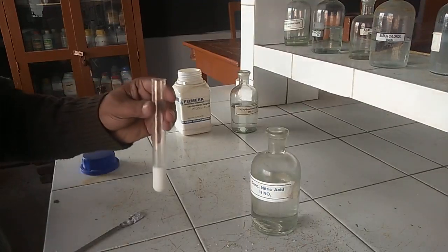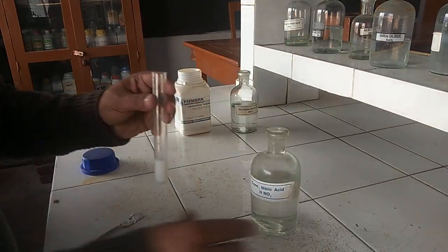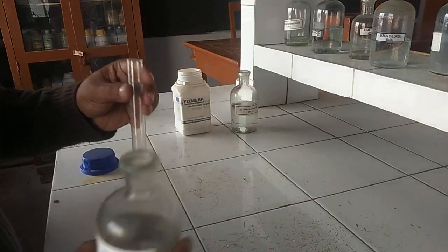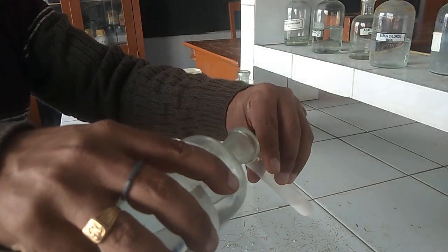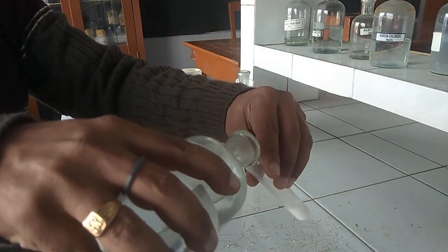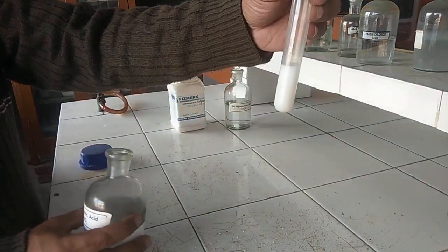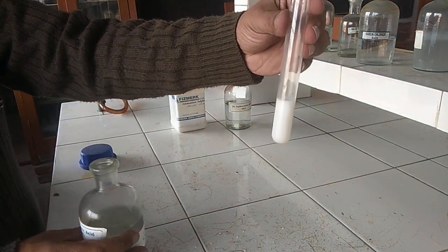The confirmatory test of sulfate ion is done with concentrated acids. We will add concentrated nitric acid to this. Observe the change. What is happening? Nothing happened. The precipitate does not dissolve in concentrated acid.